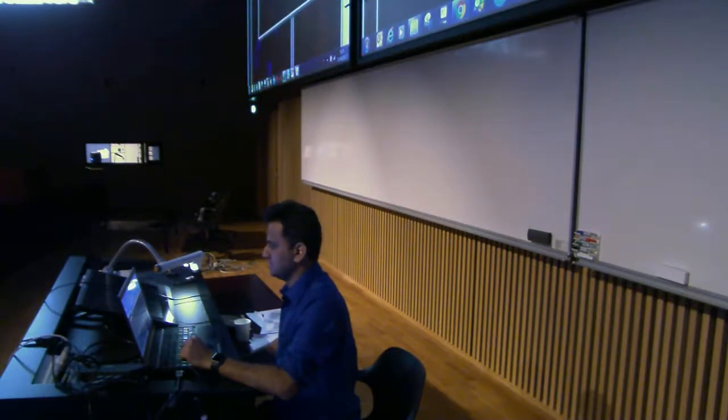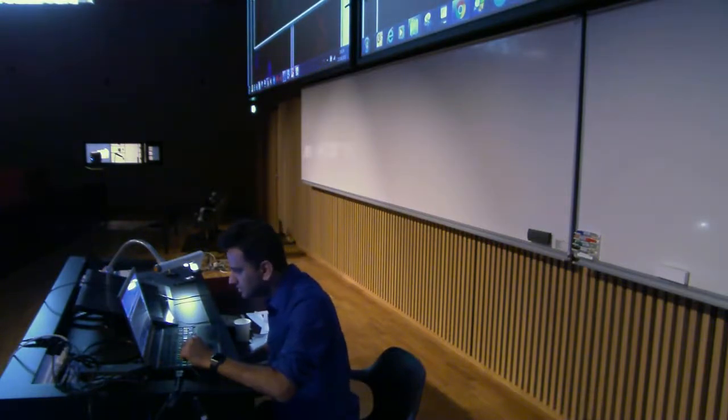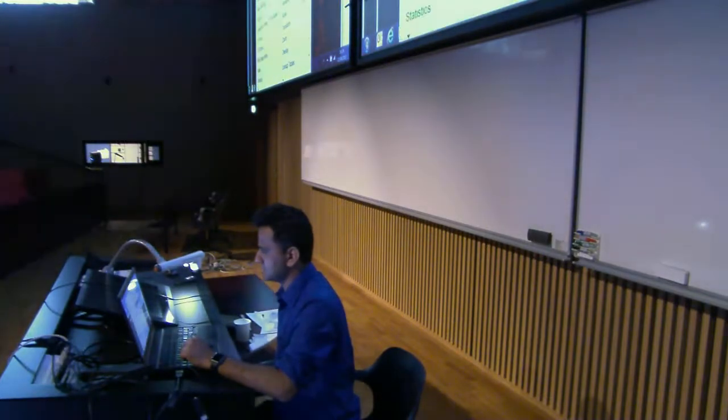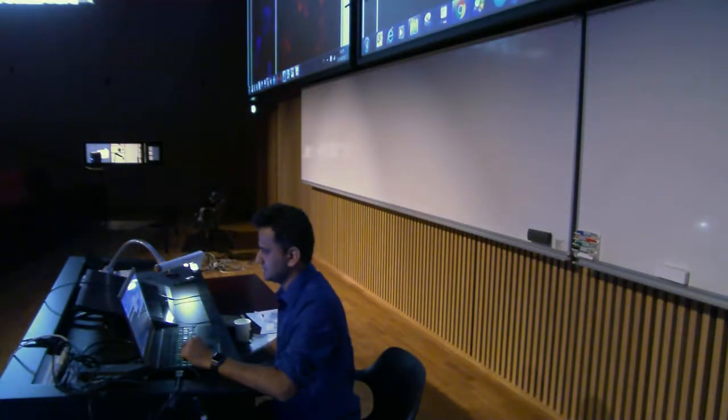So it should work now. Okay. Oh, where is the scale bar? Where is the scale bar? Why the scale bar has not appeared is because, if you make a montage, Image, Stacks, Images to Stack. Now there is this image, okay.